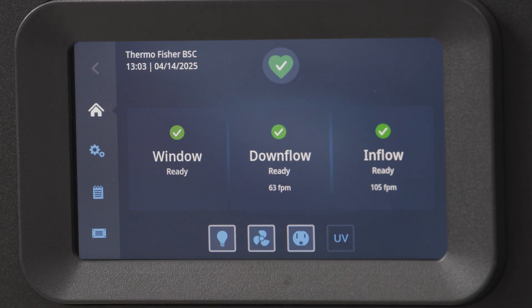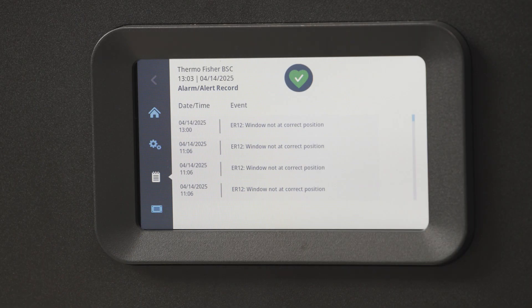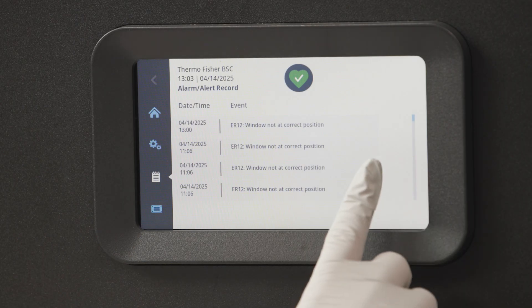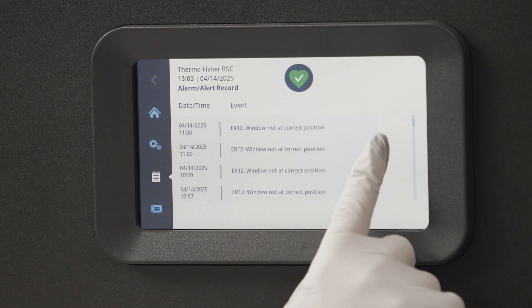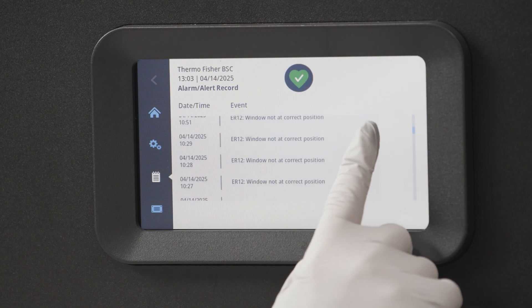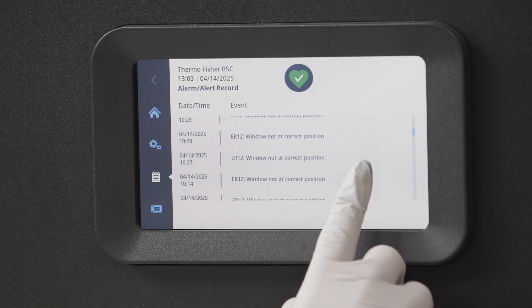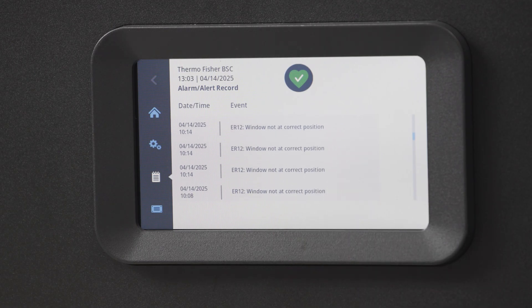Next, within the left menu icon is the event log. Here you'll find a list of alarms and alerts that have recently been activated with date and time stamps. This is helpful if an alarm was recently triggered and a service person needs to come fix the issue — rather than trying to remember what happened, you or the service technician can view the log to learn more.